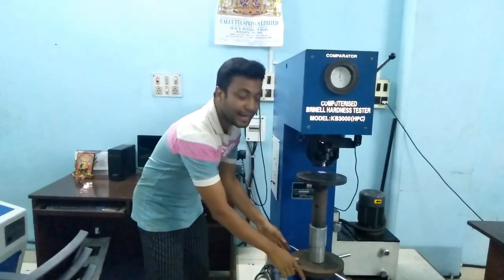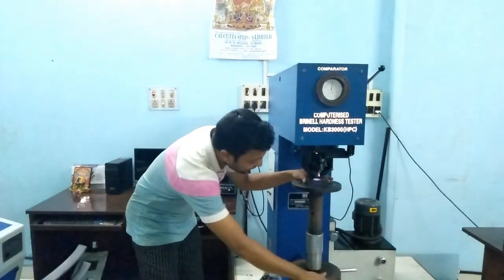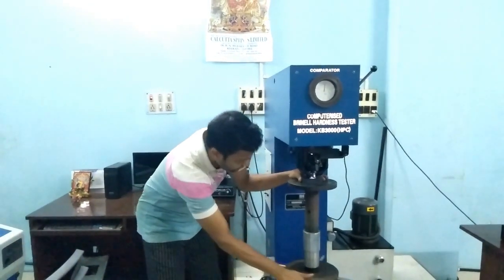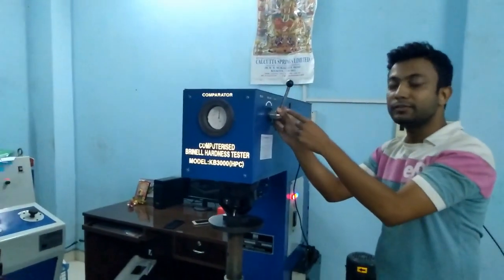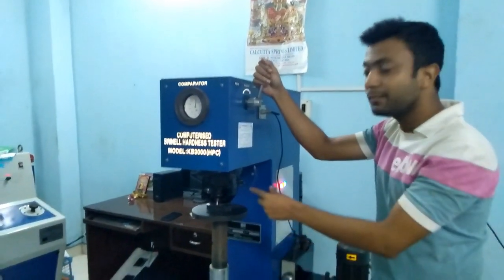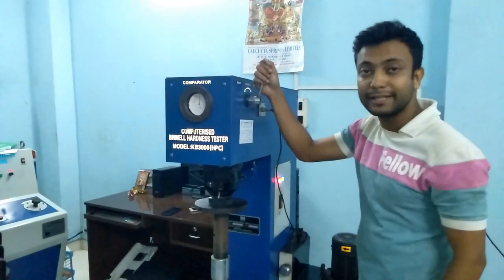We have to move the handwheel clockwise to raise the anvil and keep it in position. Now we can see the machine is in the unload position. I am going to give a load of 3000 kgf with a 10 mm ball diameter, so we can see the indentation in the fish plate sample.